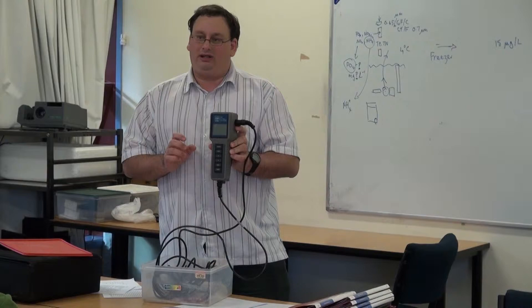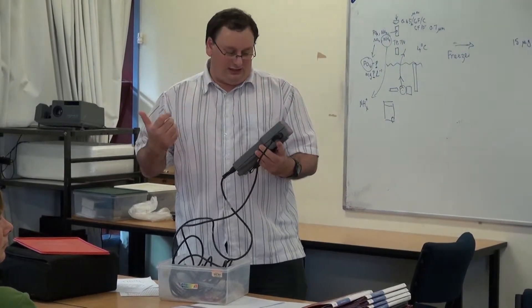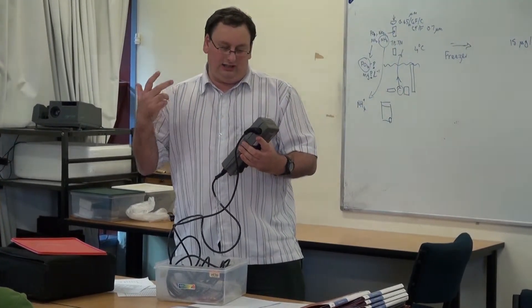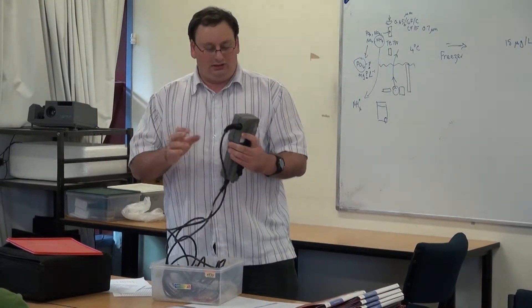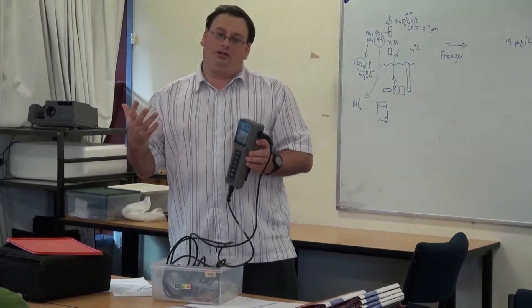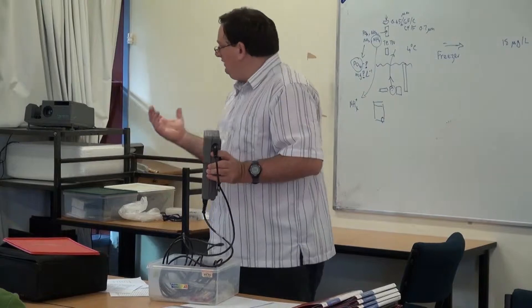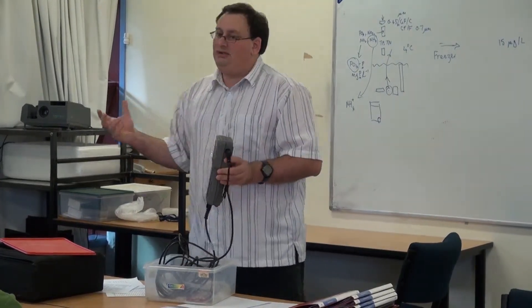This is a multimeter, so it will do conductivity and salinity and temperature and oxygen. So it's basically a combination of both the DO meter and the conductivity meter.